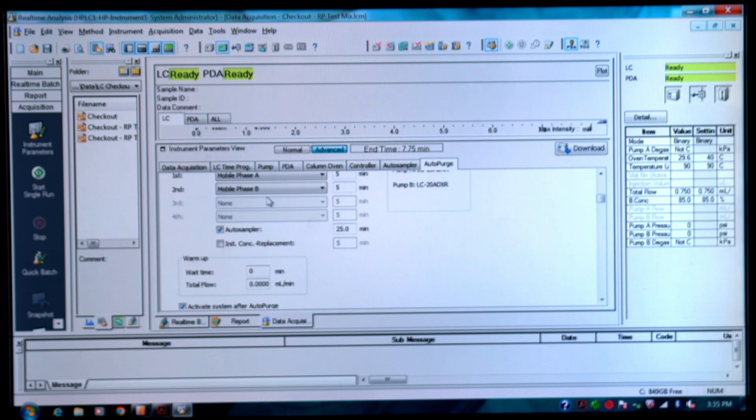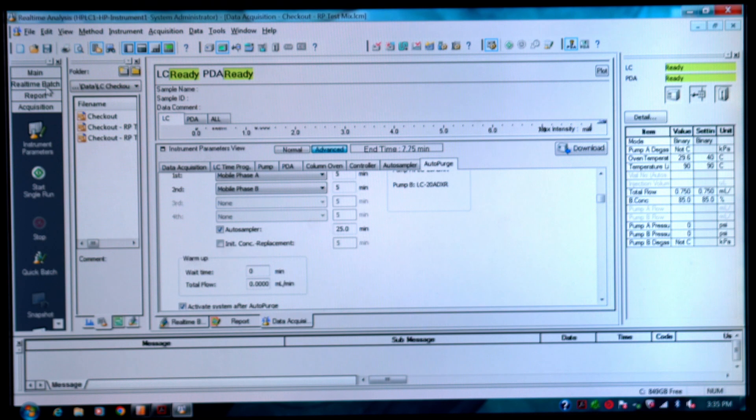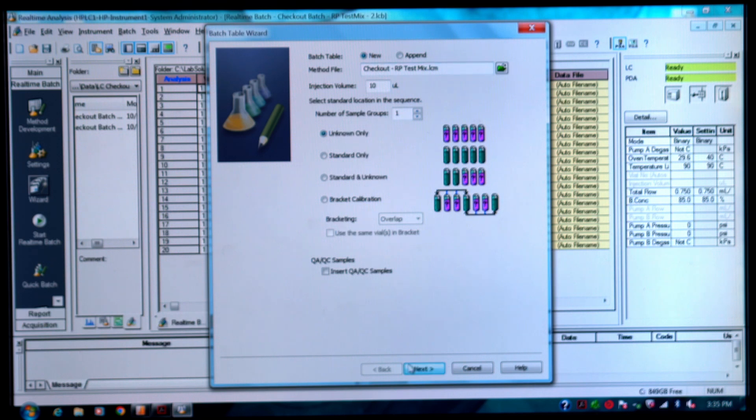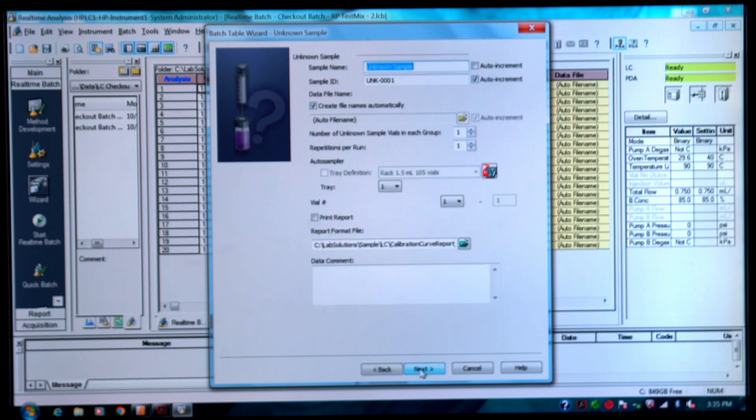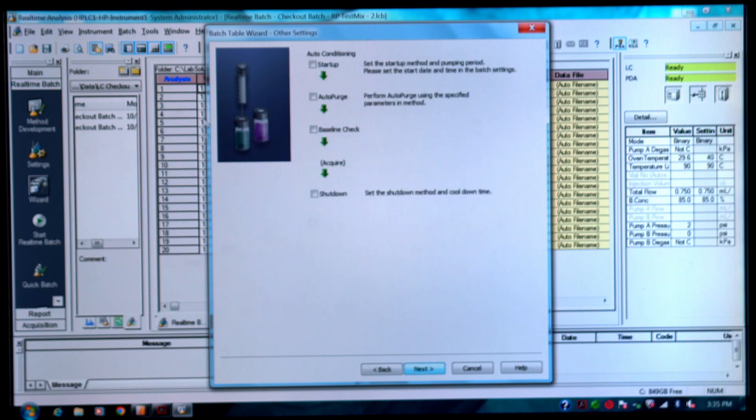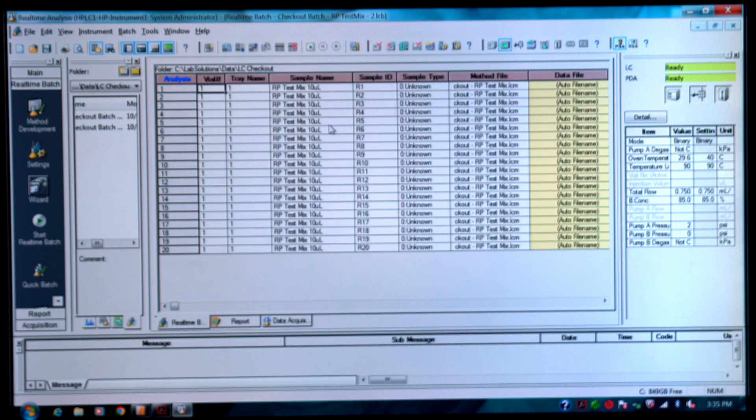If you did this within a batch, so if we go to real-time batch and we go to a wizard and you went through here for the real-time batch, the auto purge if you check this here then it'll run it for the batch as well within that method that we just set up. In that case it'll just purge through the autosampler.